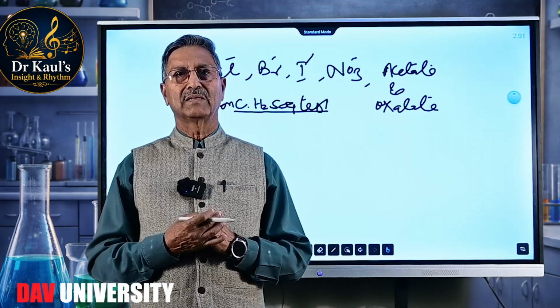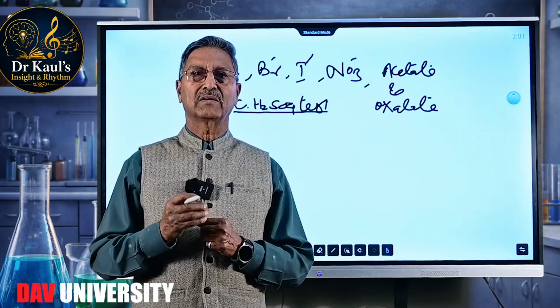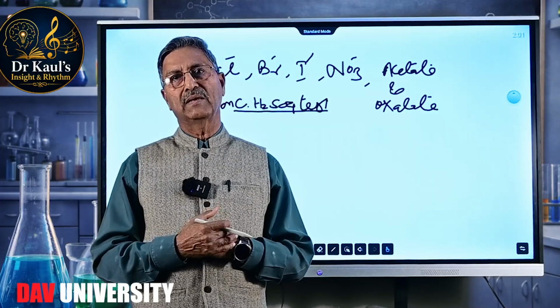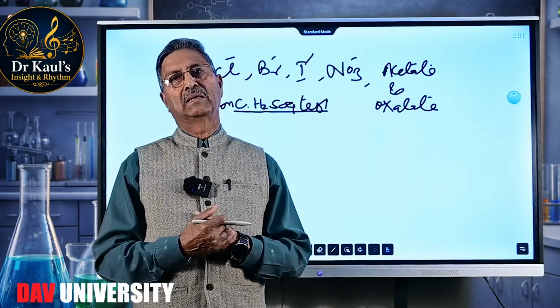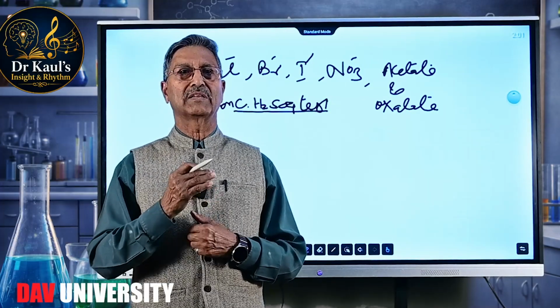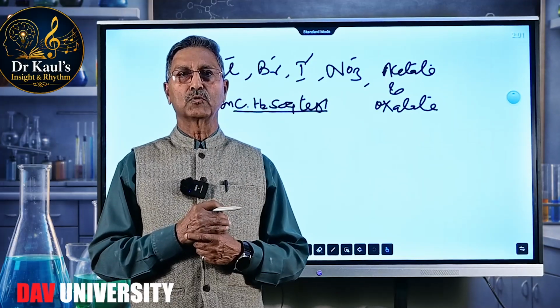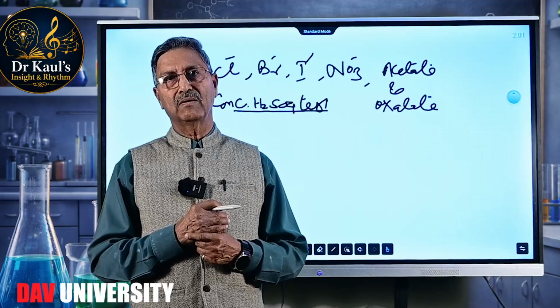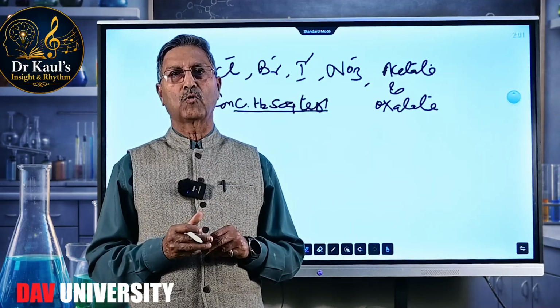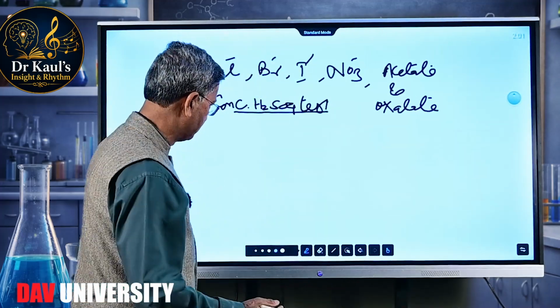So as I said, we take about 1 gram of the salt mixture and a milliliter of concentrated H₂SO₄, and we strongly heat it and observe if some gas comes out. If some radical to be detected with concentrated H₂SO₄ is present in the reaction mixture, then of course some gas will be emitted, and by observing the properties of that gas and the tests involved, we can identify the radical. Now we do it one by one.